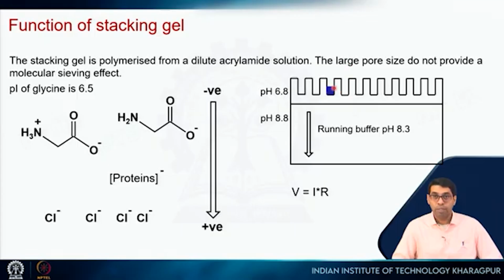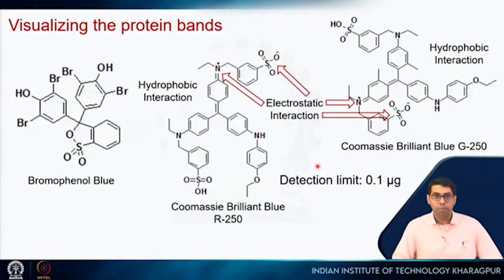So you know you are adding it properly, and then it also forms a dye front that runs slowly, something in the range of, let's say, around 5 kilodalton size, right? Even though it is small, it doesn't have a very high charge, so it will run slowly. So you can sort of tell how long you have to run the gel, right? So it serves this dual purpose.